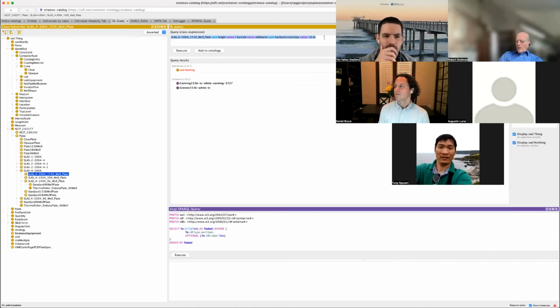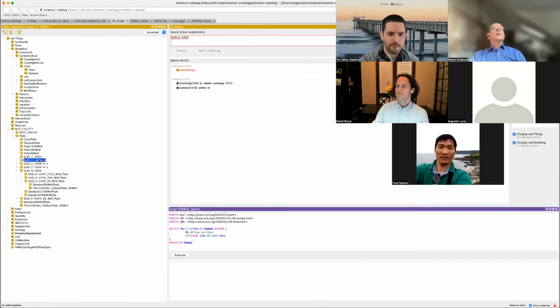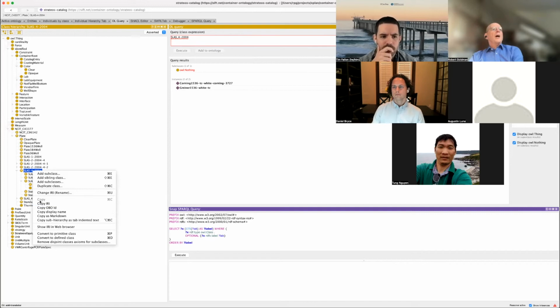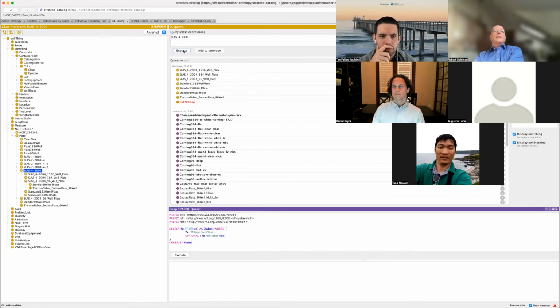But then, of course, it could be as simple as, if you want to say, well, I'm supposed to be scalable, so the only thing I care about is that this be some microplate with a standard plate layout, right?